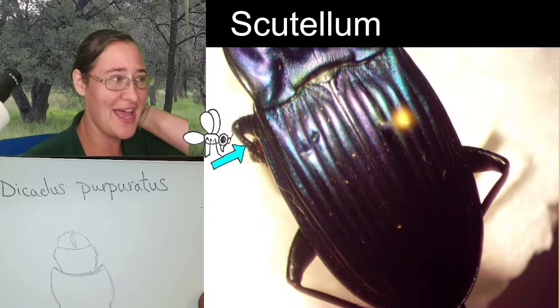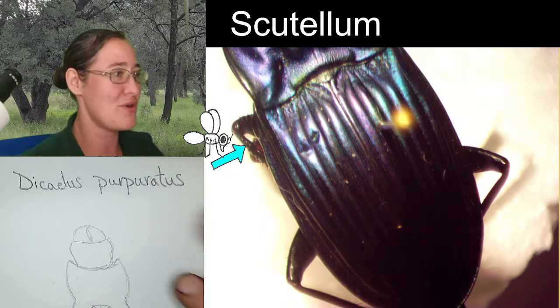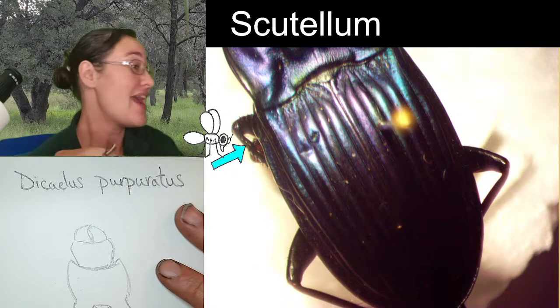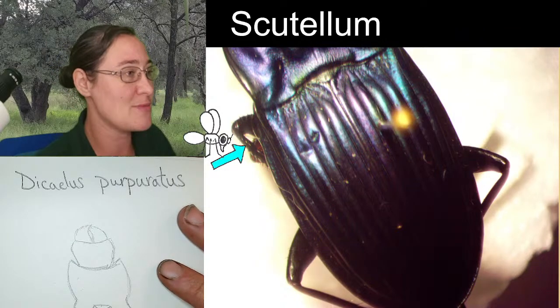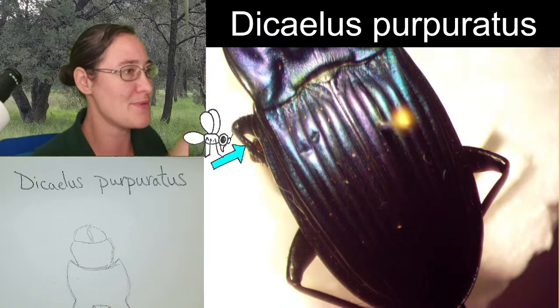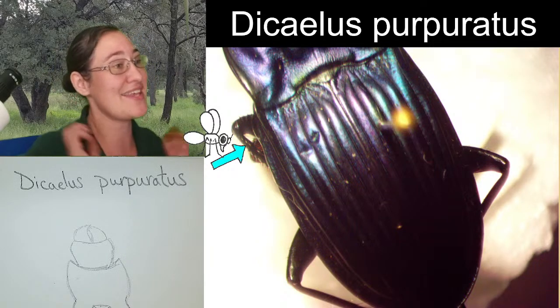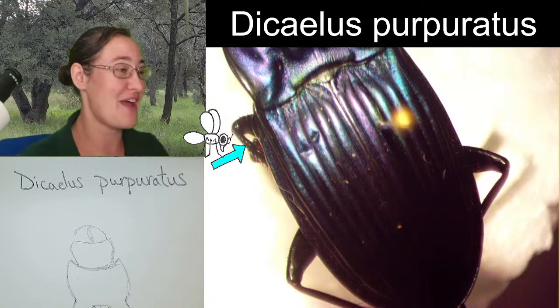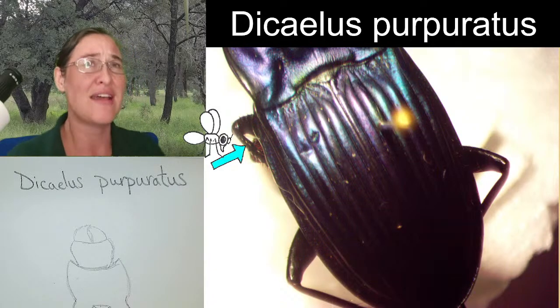I'm going to go ahead and start at the beginning just a little bit to give you a little bit of an overview. We are looking at a metallic purple ground beetle. It's absolutely gorgeous. I love it. The species is Dicaelus purpuratus. I had that written up here for a while, so you probably were able to get that. Purpuratus is what we give to insects that are purple. They're regularly metallic purple.